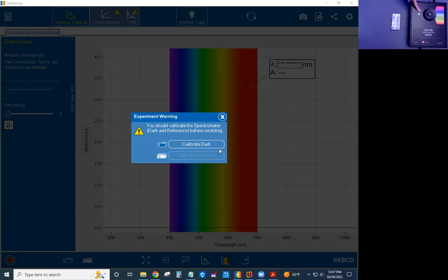So here's the spectrometer. This is this side with the light icon. This is where the light source is. The light goes through the solution, which is a 1 centimeter length. So the path length for Beer's law is 1 centimeter. The detector's on this side where you see the rainbow. So light goes through the solution. The more particles there are in the solution, the less light gets through to the detector. And the instrument is measuring transmittance, but we're going to be reporting in absorbance today.